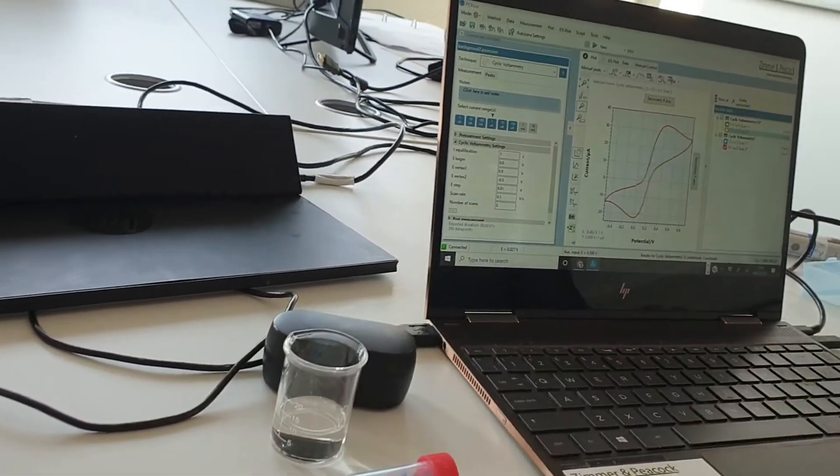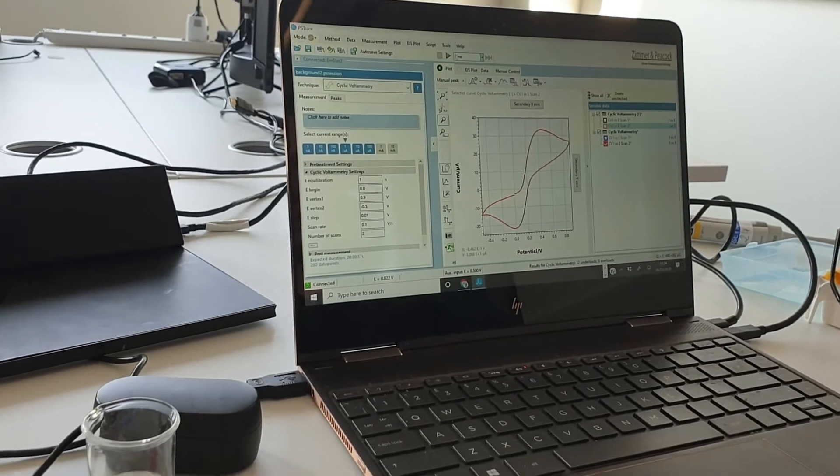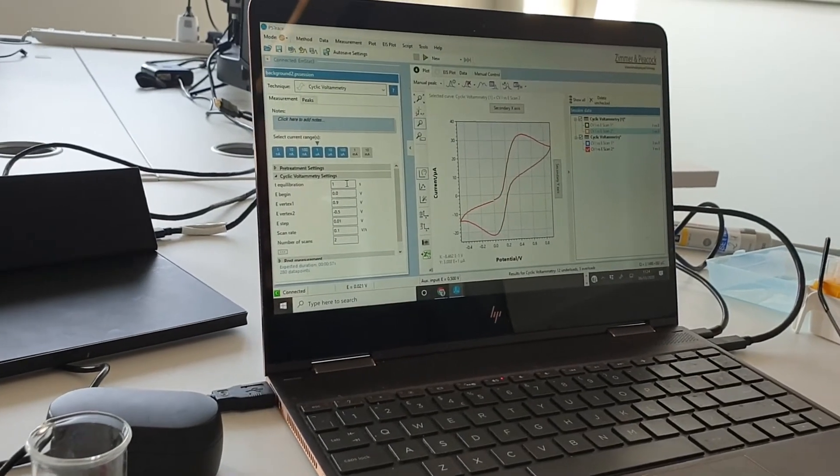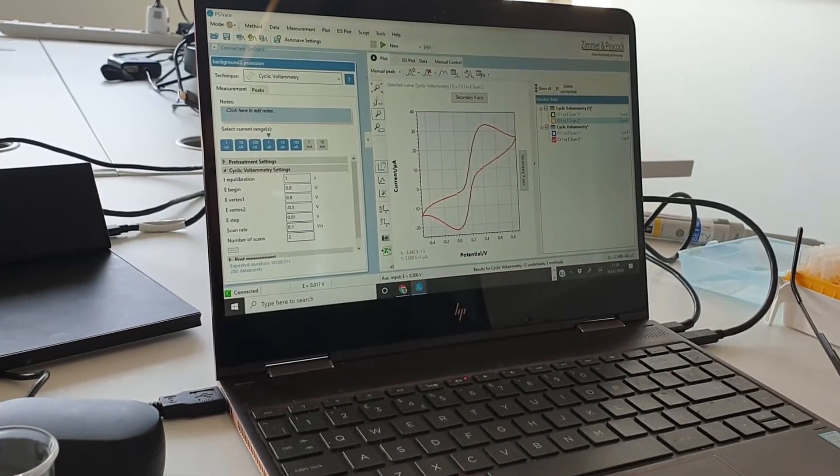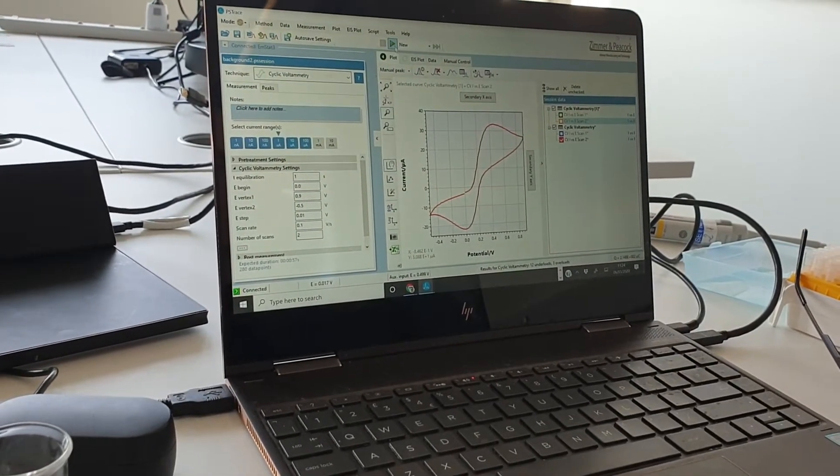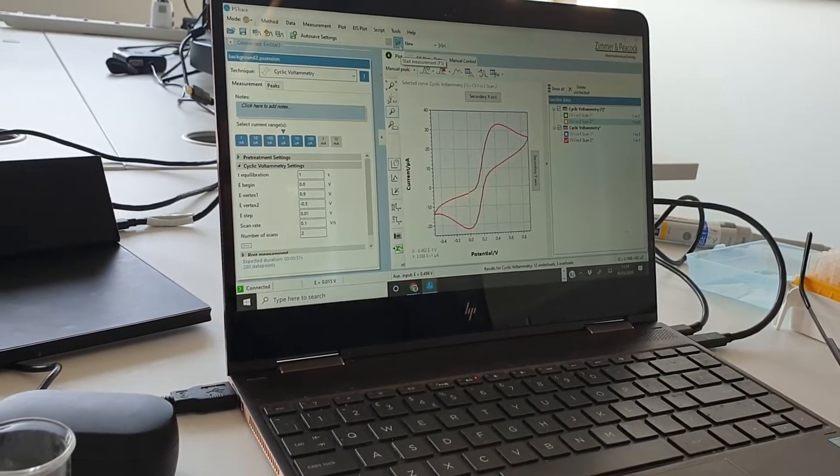So I've got all the parameters down the side and then I'm going to hit, I hit start.